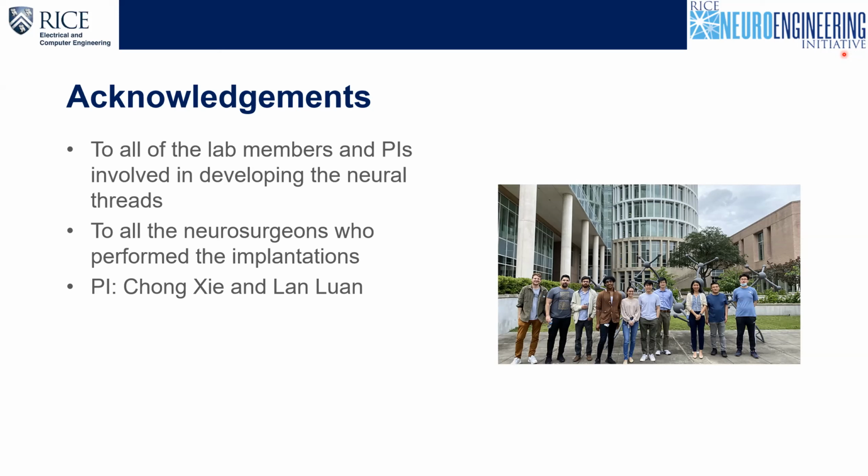Only a 30-minute recording, because I'm capturing at 70 FPS four different imaging modalities or cameras, and then you have 30 kilohertz sampled electrical recording from 100 channels. So you can imagine how much data. And as a matter of fact, we use 3 different PCs because the data rate is limited. When we're doing the experiment, we need to separate out the data streams because the USB does not have that much capacity. Yeah, it's quite intensive in that sense.